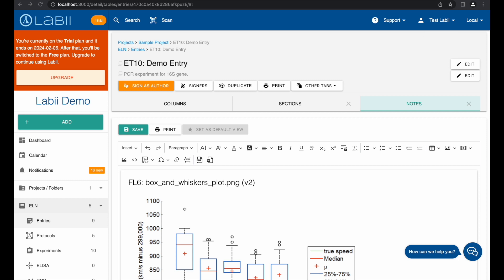Fourth, Labii Electronic Lab notebook offers extensive support for hundreds of widgets developed by the platform, allowing for versatile scientific research documentation. These widgets cover a range of functions including molecular biology, ELISA data analysis, chemical structure drawing, workflow management, and more. With native support for these widgets, users have the ability to document their research in an unlimited number of ways.